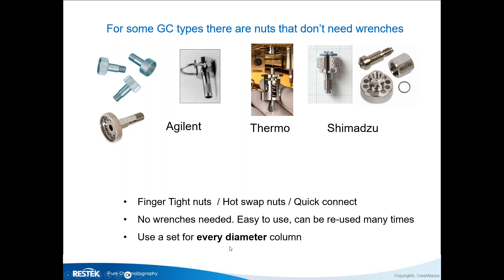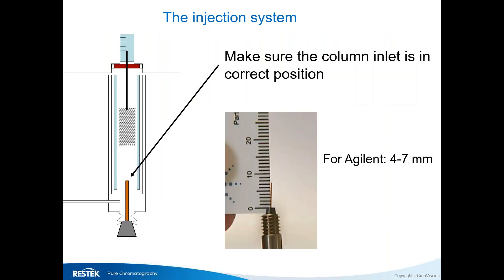I always recommend using a dedicated set of finger-tight nuts for one column diameter only — a set for 0.25, a set for 0.32, and a set for 0.53. You can reuse them many, many times, which saves a lot of money because you don't have to use new ferrules for a long time.